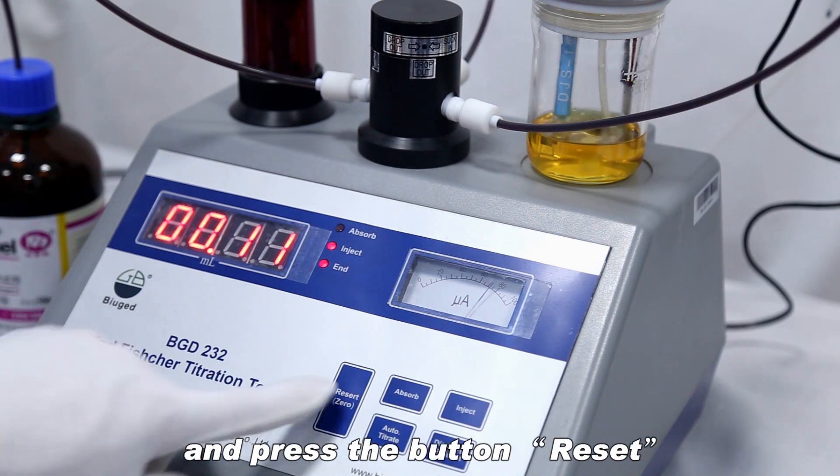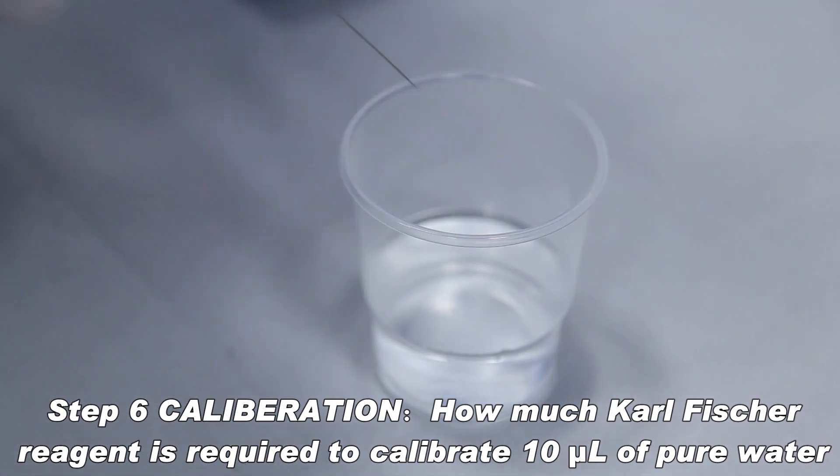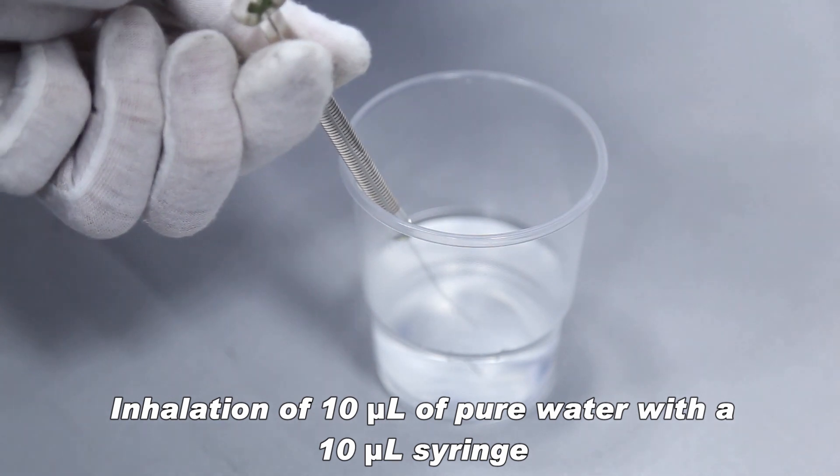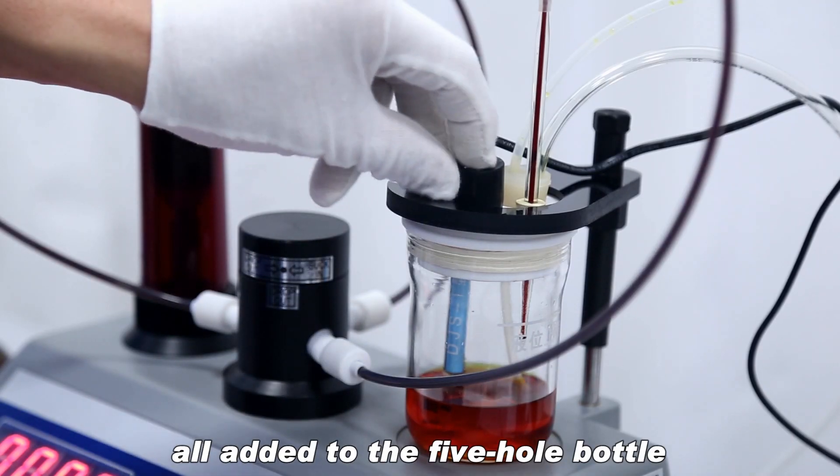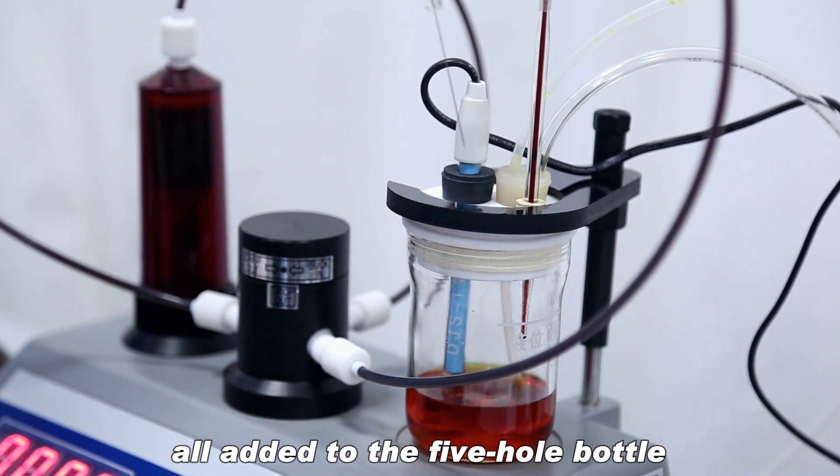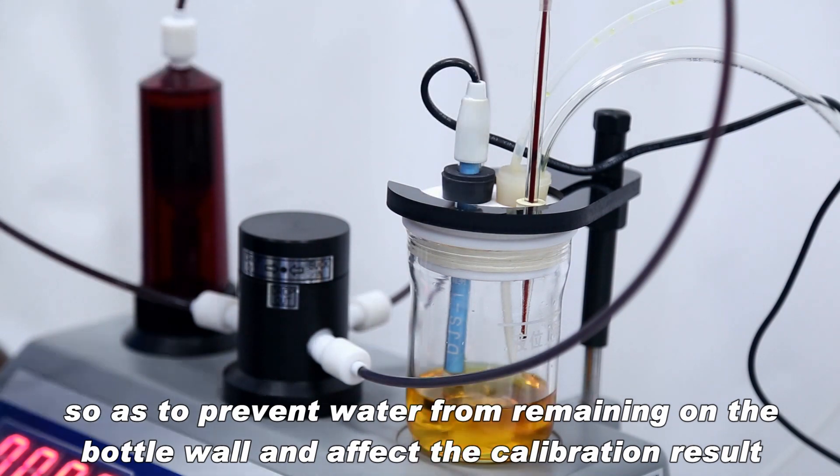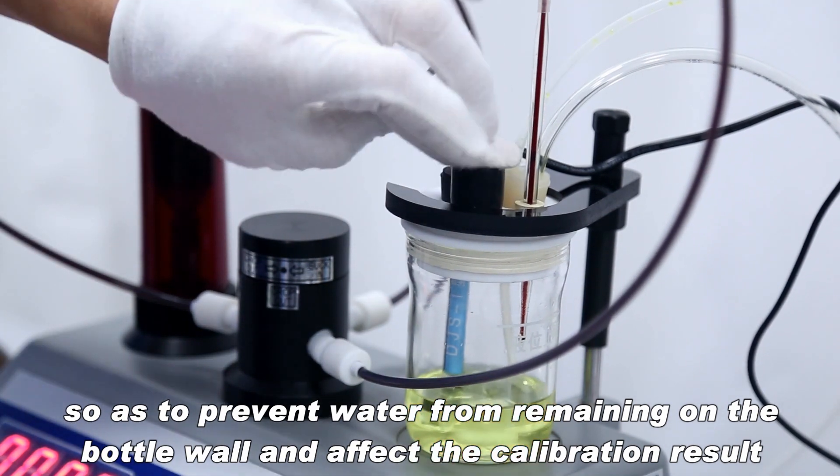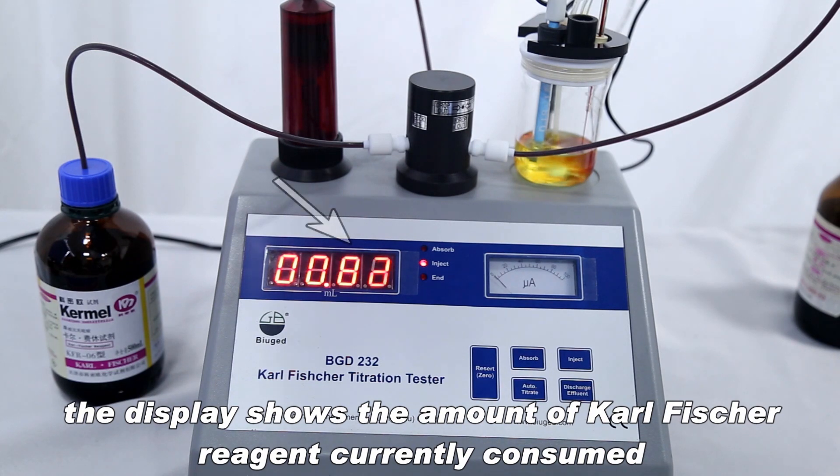Press the button reset. Calibration: how much Karl Fischer reagent is required to calibrate 10 µL of pure water? Inhalation of 10 µL of pure water with a 10 µL syringe, all added to the 5-hole bottle. Note that not to drip onto the bottle wall when dropping, so as to prevent water from remaining on the bottle wall and affect the calibration result. Press the titrate button and the instrument starts titration. The display shows the amount of Karl Fischer reagent currently consumed.